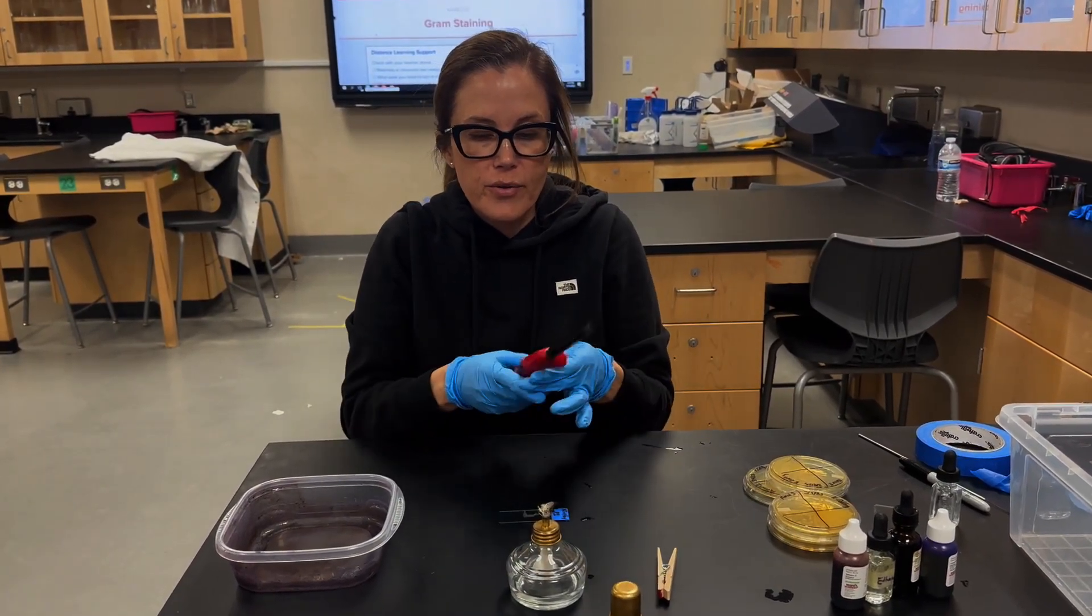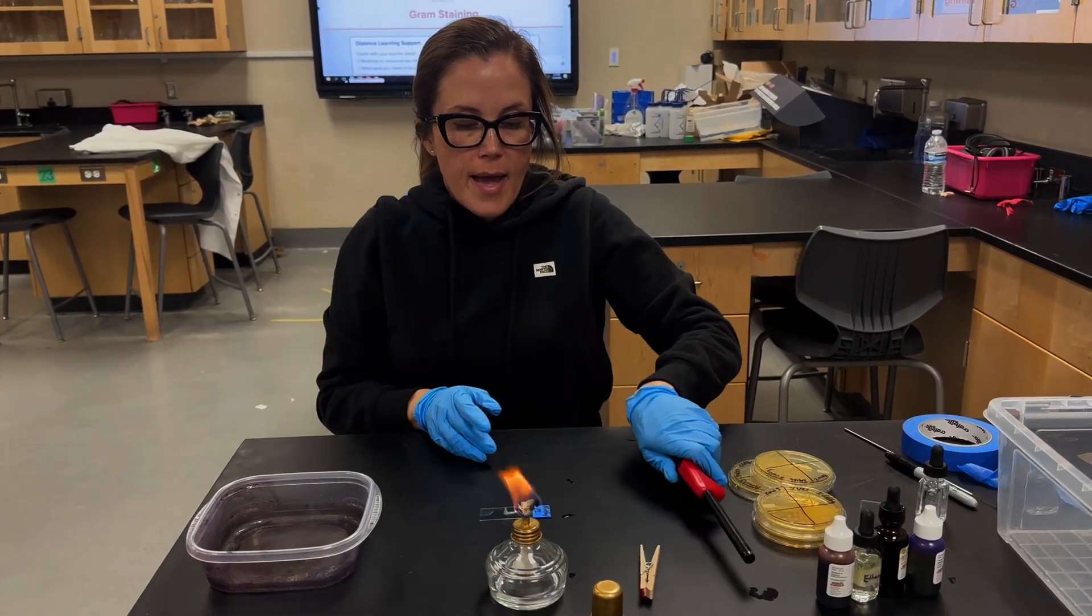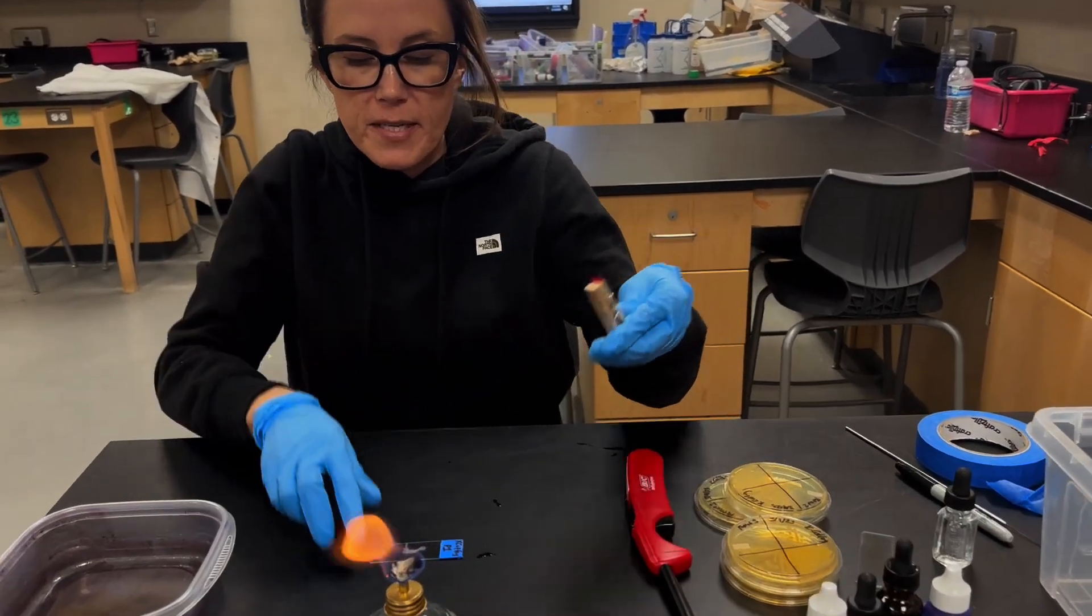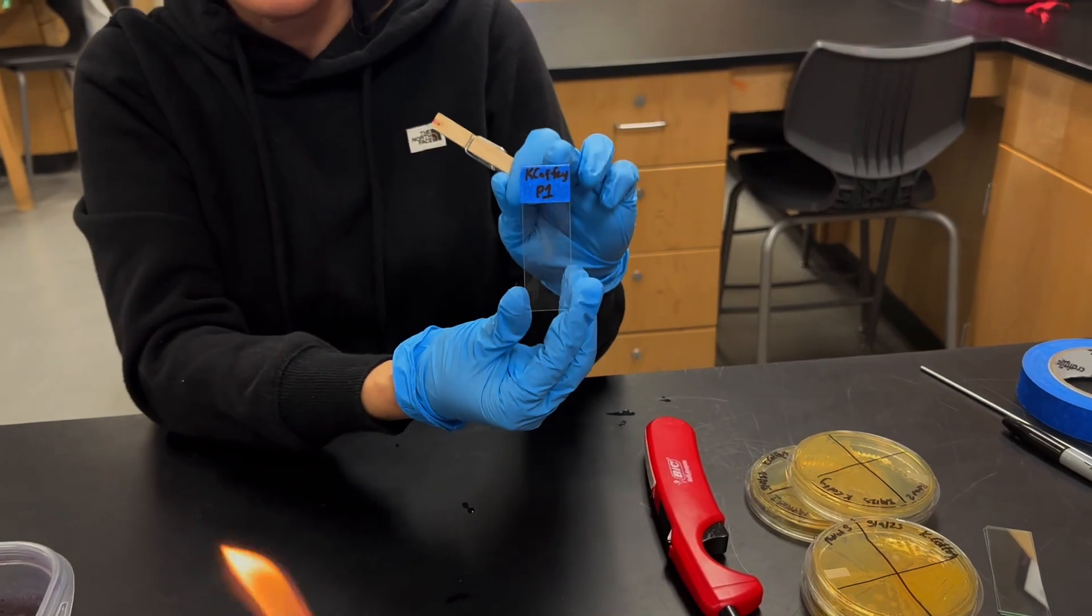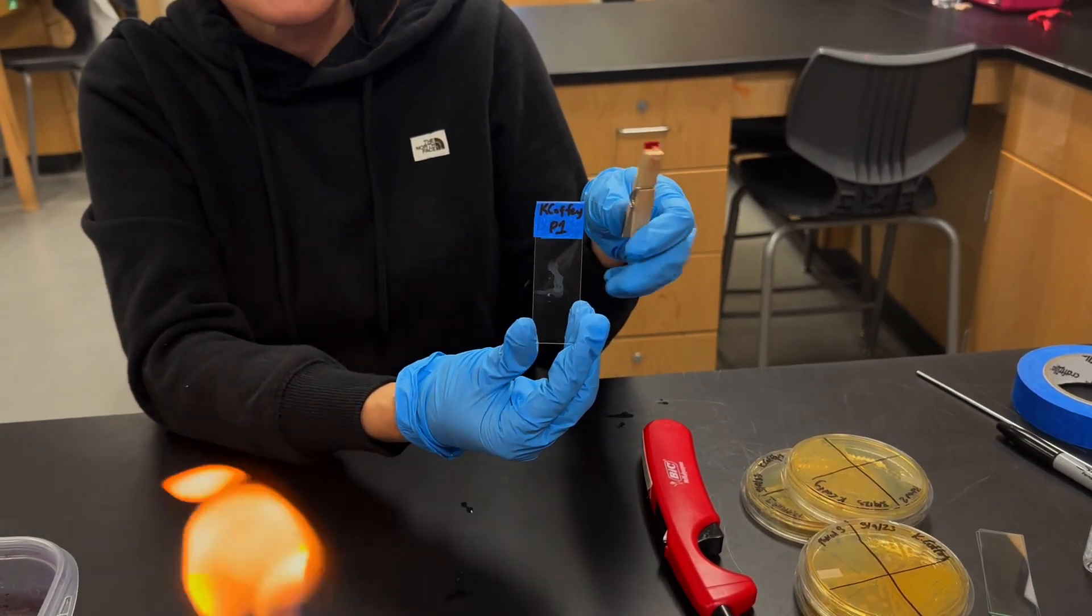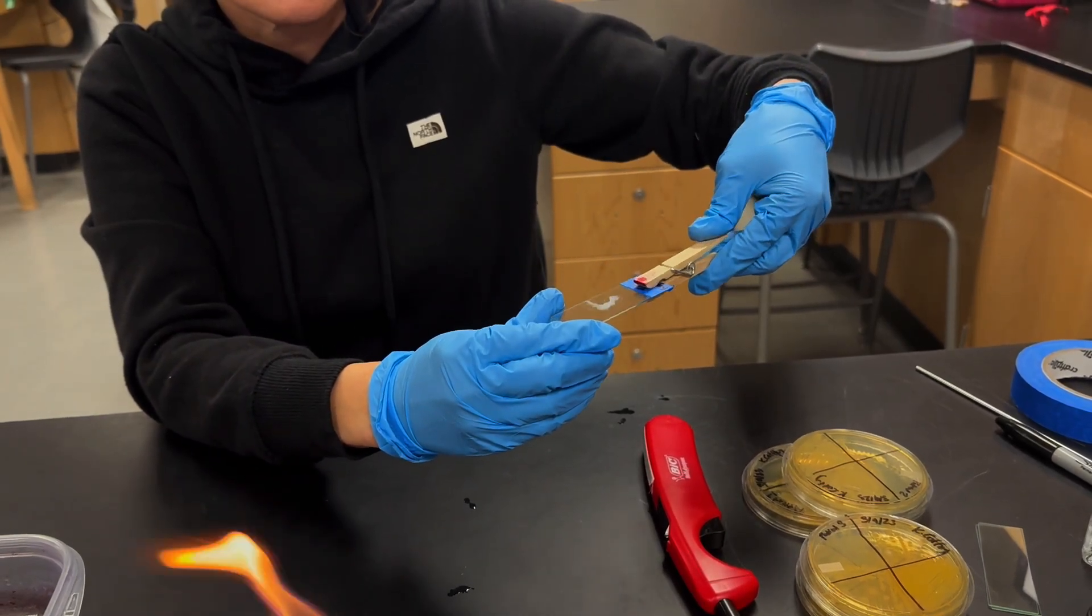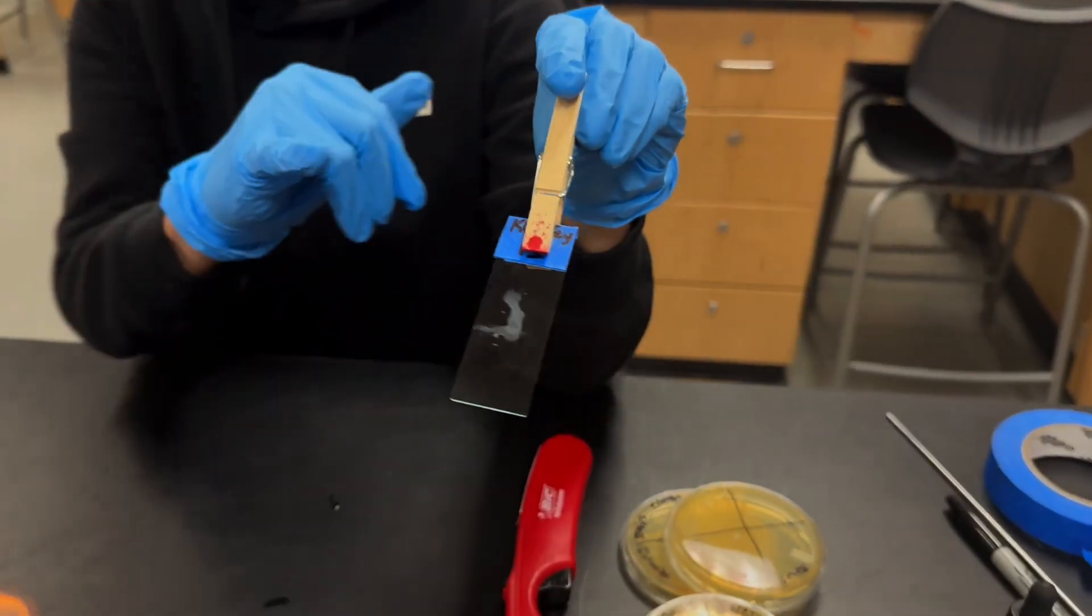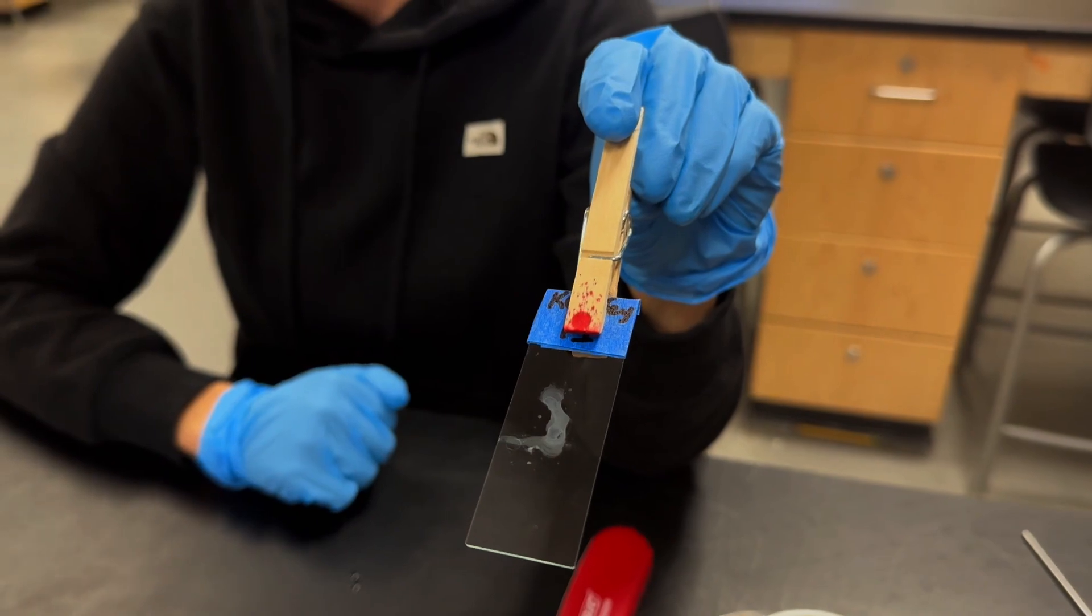And in my class, we use these clothespins and you can see I've actually, while we were waiting, I added a label to the slide. So I just put my name and period my class period here on the slide. And I'm going to use the clothespin to help me with this process for staining. And the bacterial specimen is on top of this slide. So it's facing upward and that's important.